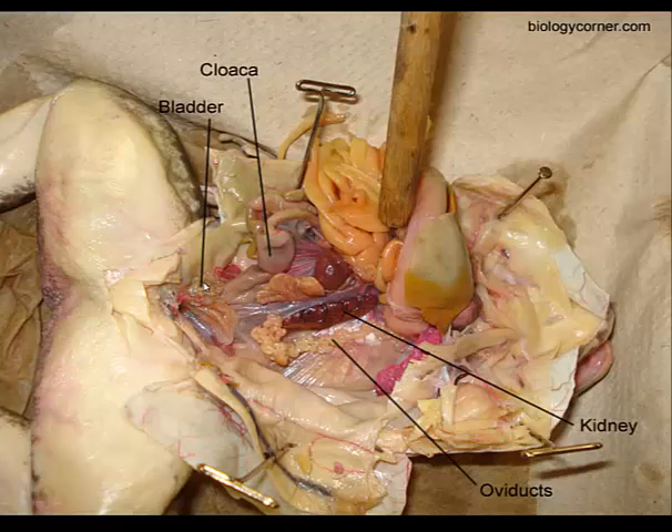You'll need to find the urinary bladder in both males and females. It's located right around the same place as the cloaca — it's just a small sac-like structure. We're looking right down in that pelvic region of the frog, near the big muscles of the hind legs.